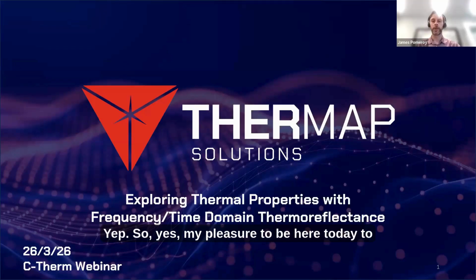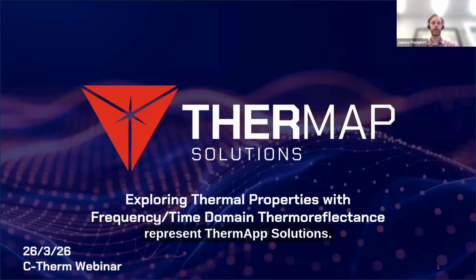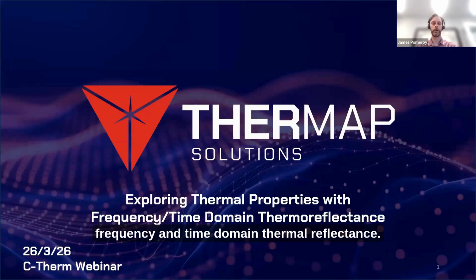Yep, so it's my pleasure to be here today to represent Thermap Solutions. And over the next 30 minutes or so, this webinar is going to be exploring how to measure thermal properties with frequency and time-domain thermoreflectance.